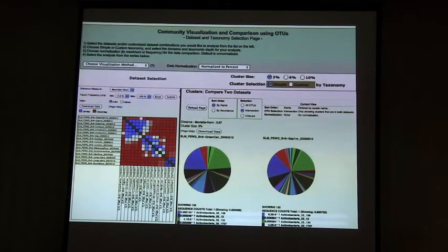So this is an example of looking at OTUs, not necessarily the same data set I was showing you before, but an example of OTUs that are now used in a heat map presentation. These taxon independent OTUs are really useful because we calculate them against all the samples that we have in VAMPS of a particular sequence target. So we've OTU'd virtually all the V6 sequences in VAMPS.